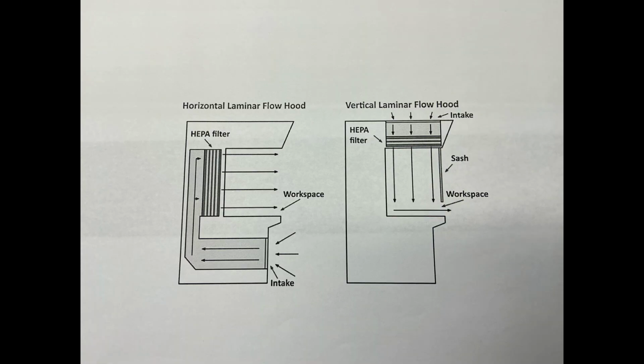Moving on to airflow, we're going to be talking about your working environment. So you have your horizontal laminar flow hood and you have your vertical flow hood. The horizontal laminar flow hood is the most commonly used hood as it is used to compound non-hazardous medications.